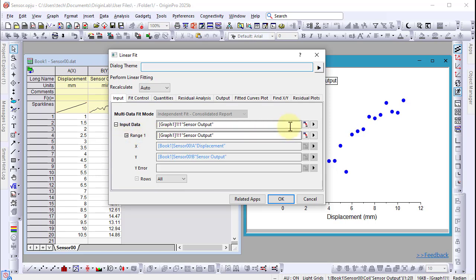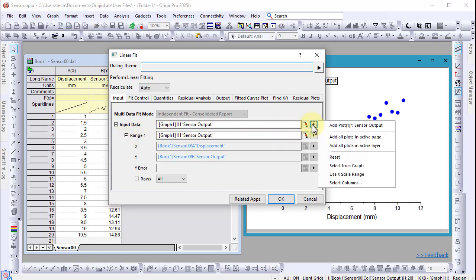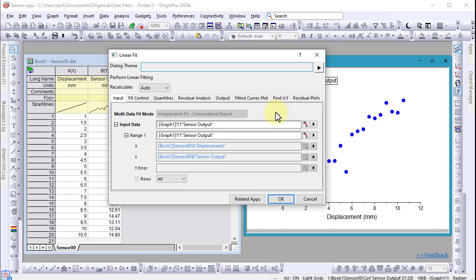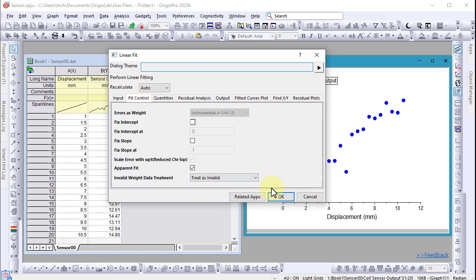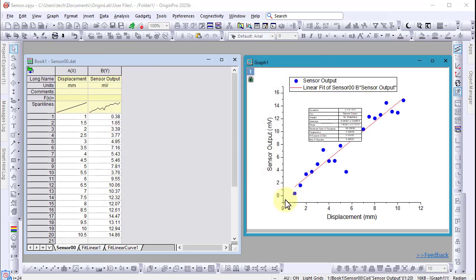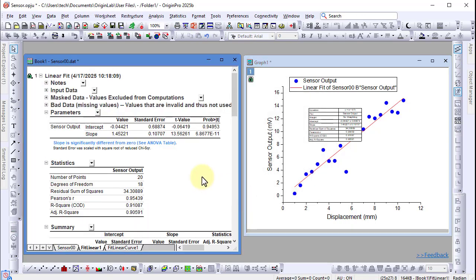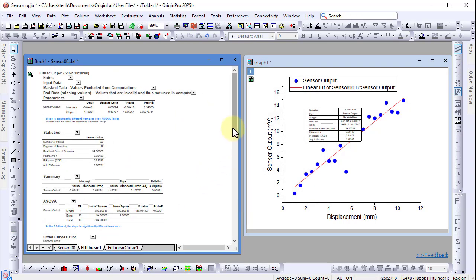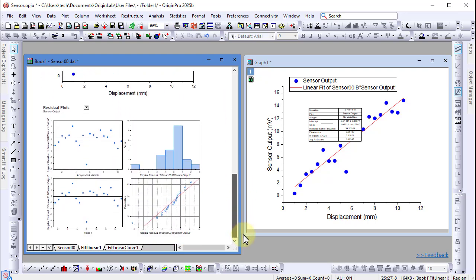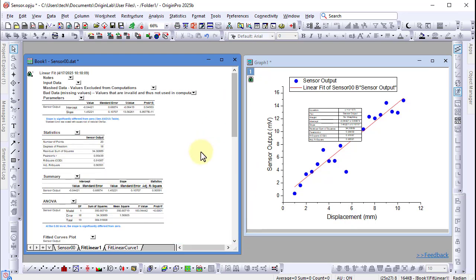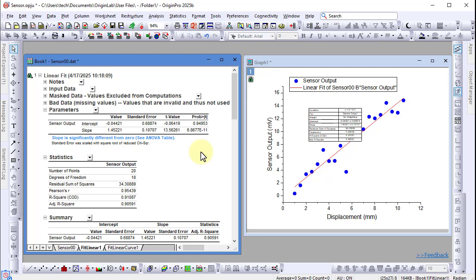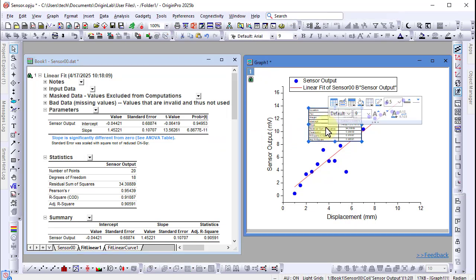Origin will select the active data by default. But using the flyout menu, I am free to add any additional data. After the fit is complete, the report sheet will appear. This contains the results of my analysis. These results are also contained in a report table that appears on the graph.